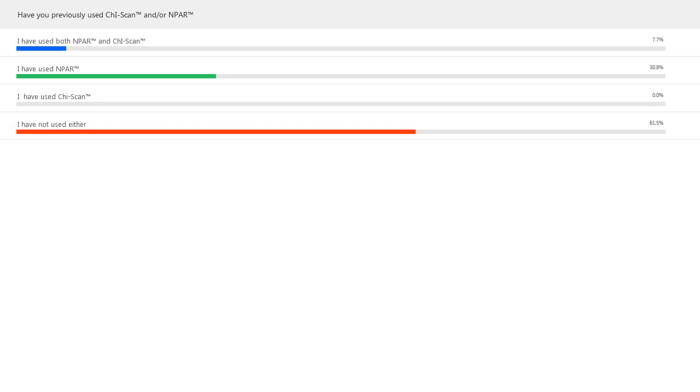And I hope webinars like this give you guys the idea that these tools exist and you should be using them. I wish I could do a poll on the fly, but it'd be really interesting to see why you guys are not using these, either because you didn't know about them or didn't know how to use them. Is it a question of awareness of these options, or just not the training required to use them? And that's where I think these webinars are pretty important. So again, very interesting results, guys, and thanks to you for taking part in that poll.